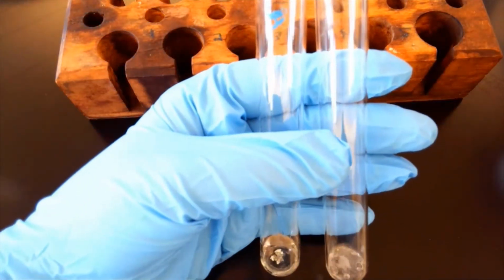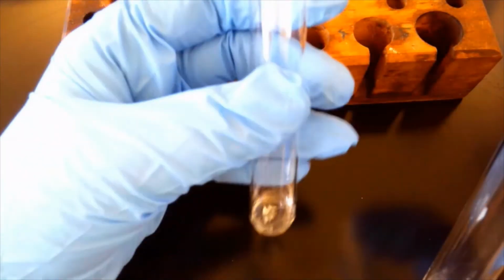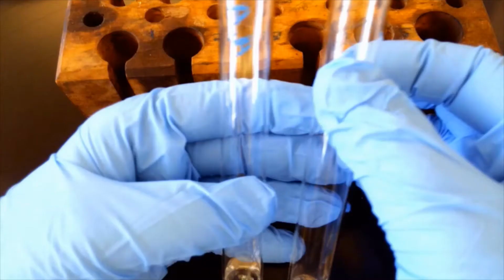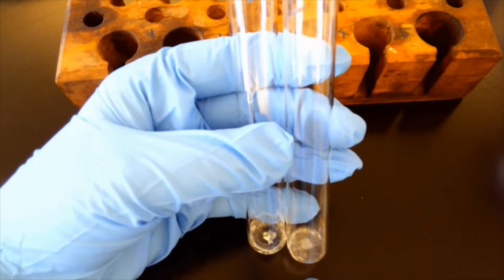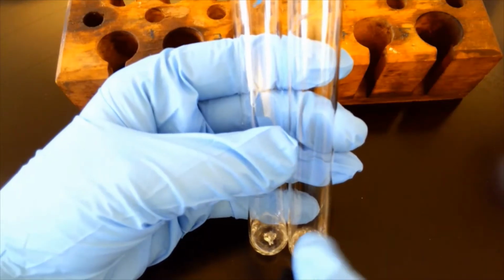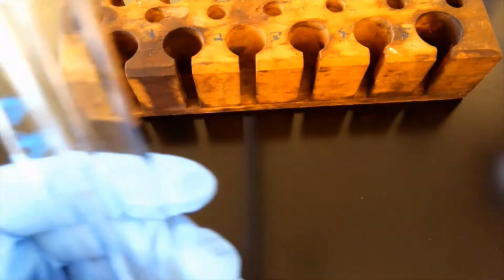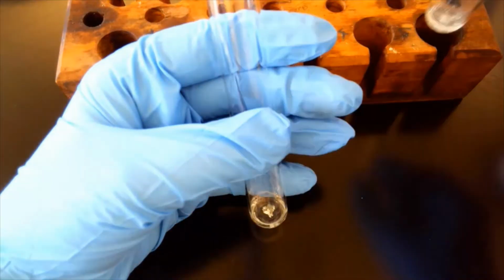And our acetic acid, not a lot happening with the zinc. Little bubbles here and there, nowhere near. So that's what's happening there. So we have HCl and acetic acid, and they're both bubbling, mind you, okay? The acetic acid is still bubbling too. I'm going to try to bring this closer.